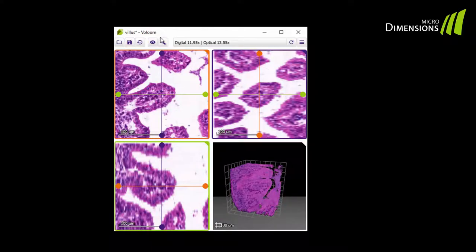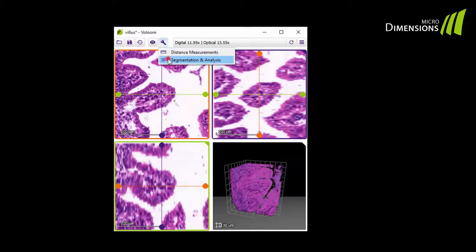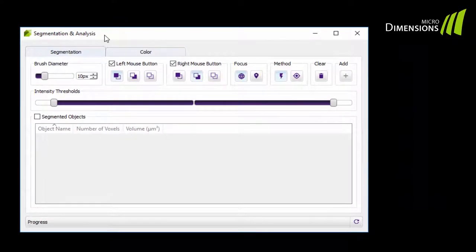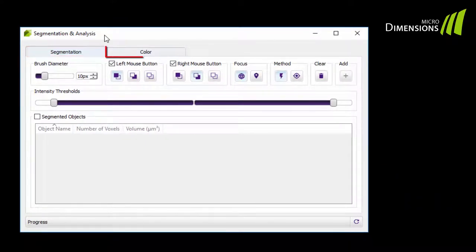To open the tool, click on the Tools button and select Segmentation and Analysis from the menu. Within the Segmentation plugin you'll find two tabs, one for segmentation and one for color manipulation.